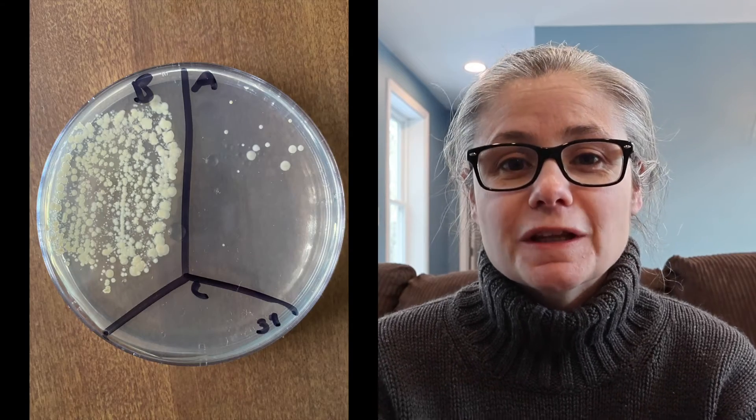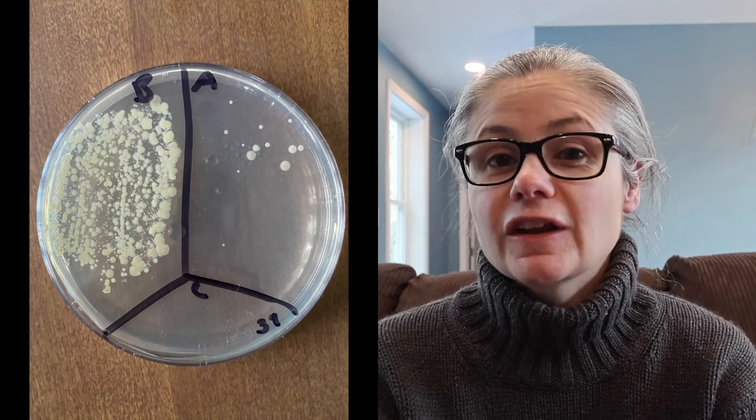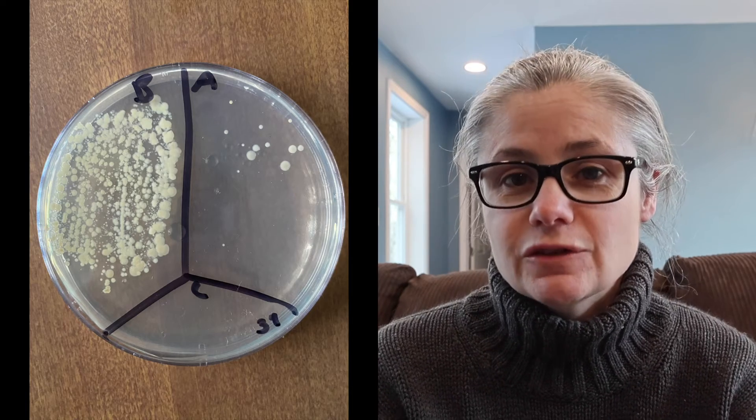The second sample: in the before section we can see a lot of bacteria, and in the after section again we can see a visible decrease in bacteria. So overall, the Snowbowl did a pretty good job at removing some of the bacteria from my toilet bowl, even though they make no claims to be able to remove any bacteria.